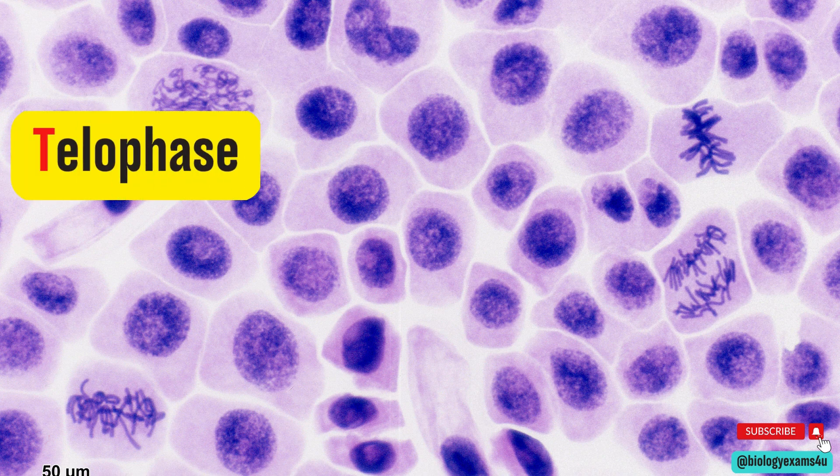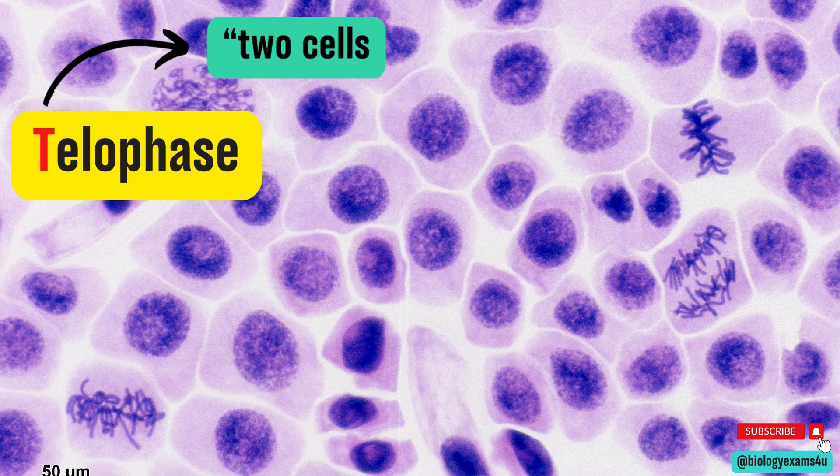Next is the telophase. T stands for two cells. In telophase the chromosomes are clumped together at the poles. The cell itself appears to be pulled apart and two new cells are starting to form. The second clue is that the size of the newly formed cell is often small compared to other cells.